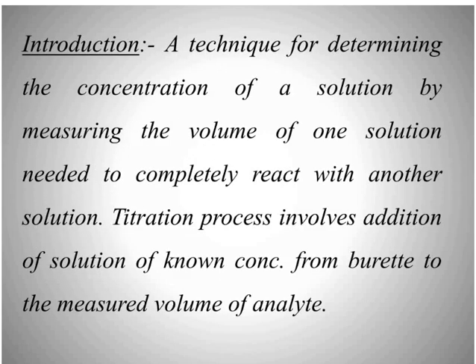A technique for determining the concentration of a solution by measuring the volume of one solution needed to completely react with another solution. The titration process involves addition of a solution of known concentration. Here known concentration is very important. It is added from the burette, where you will find the known concentration, to the measured volume of analyte.